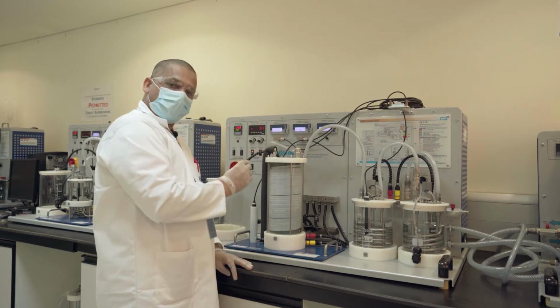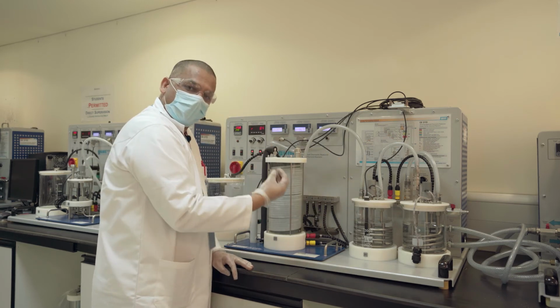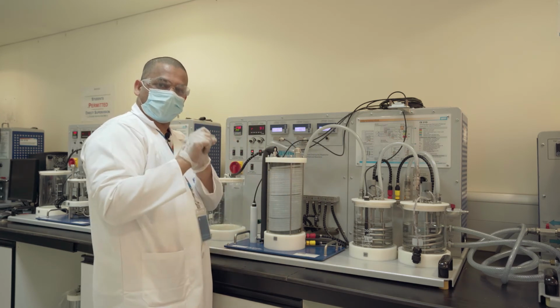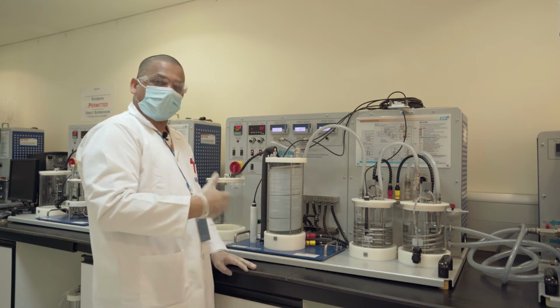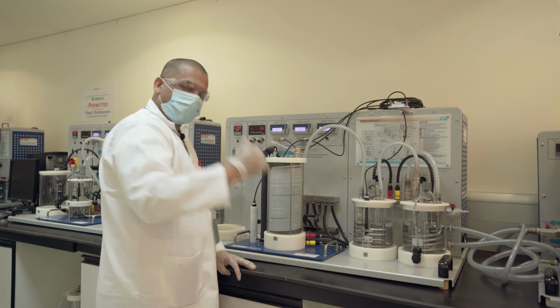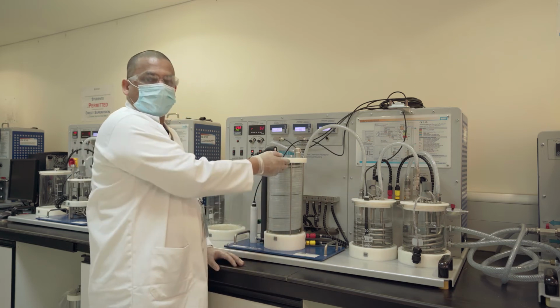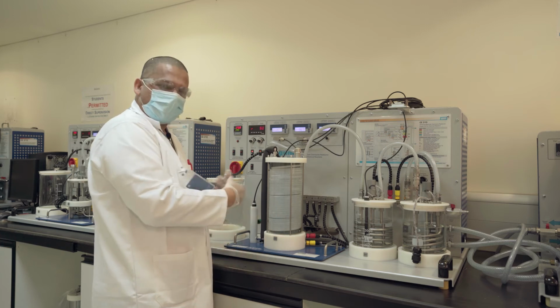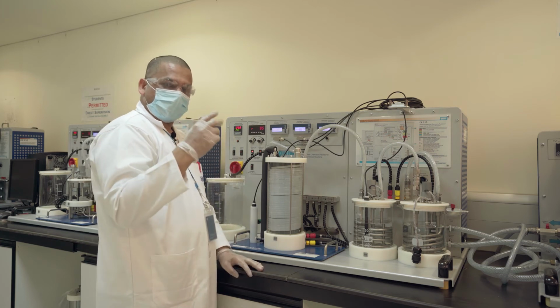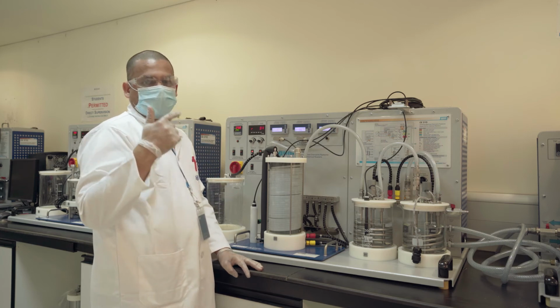So the same set of data we are collecting: the final conductivity, the conductivity at equilibrium when the equimolar concentration is there, at known temperatures, so that I can use them and plot to find out the EA value and the A naught. In case I also want to find out alpha and beta here, I just take a known amount of sample that I want and allow it to measure. It's the same, but here it's a little bit difficult to control. That's why we use the batch reactor to find out alpha and beta. The plug flow reactor and CSTR we use to find out the value of activation energy and A naught.